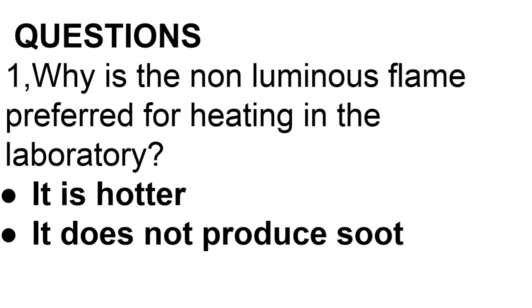So reason number 1, it does not dirtify the apparatus. Why? Because it does not produce soot. It does not produce soot, therefore it does not dirtify the apparatus. And reason number 2 is it is hotter. It is hotter than the luminous flame. Therefore, it will take a shorter time for the heating to take place.